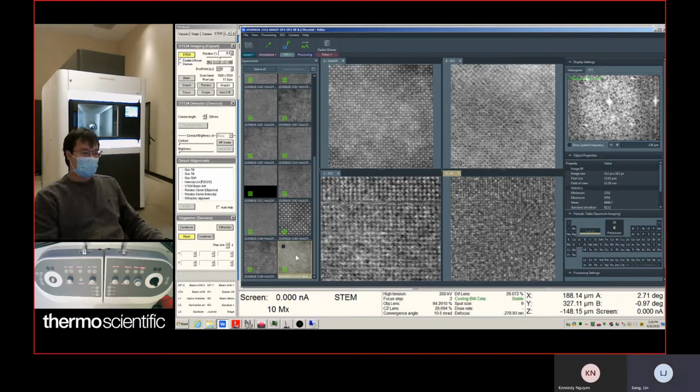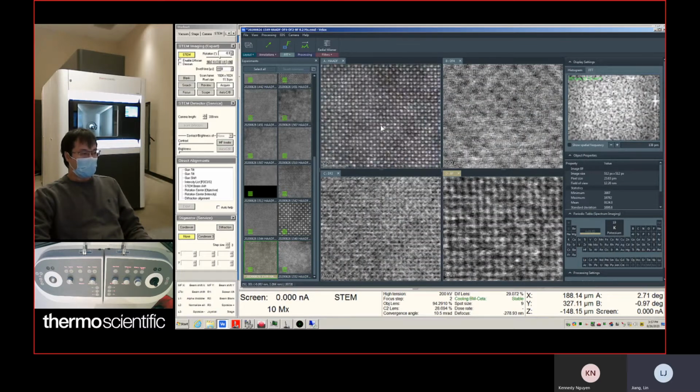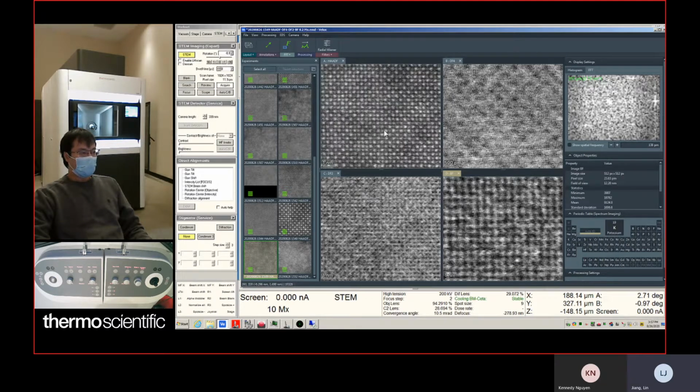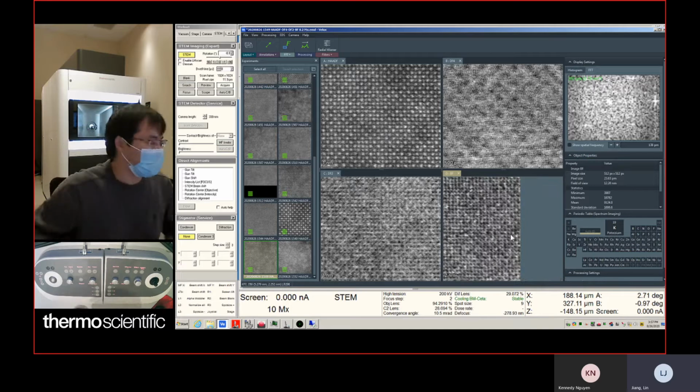But in the high angle dark field, if you have two different particles with different components, meaning they have different atomic numbers, you might see different contrast between the particles. So, yeah, this is a case by case scenario. From an atomic scale, we can mainly tell the atomic number difference from pure Z contrast, and we can tell phase difference from the diffraction contrast.